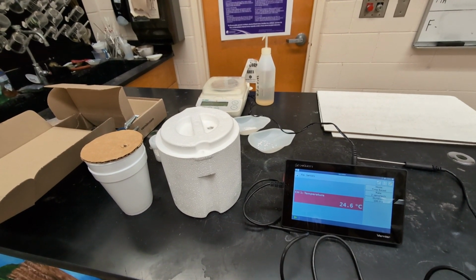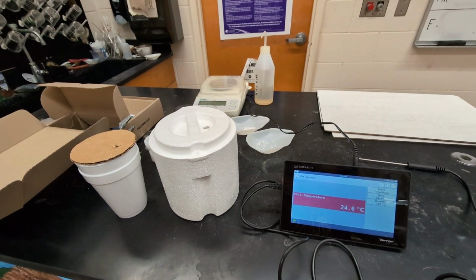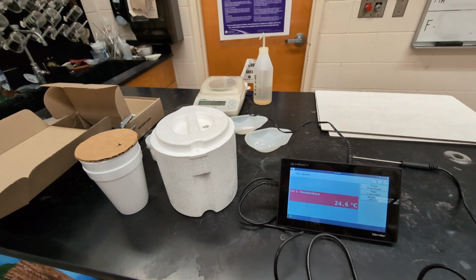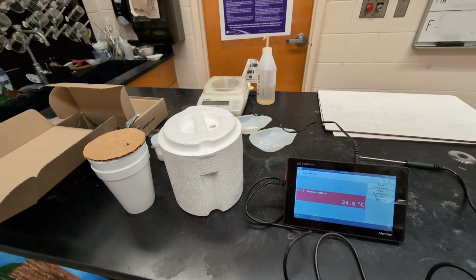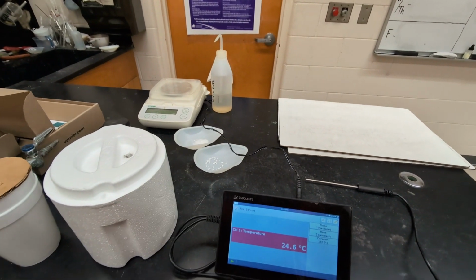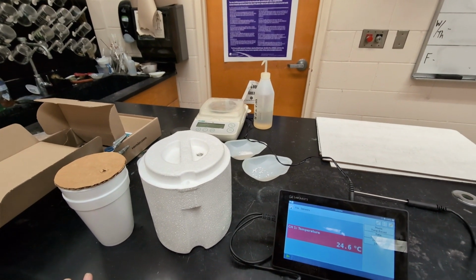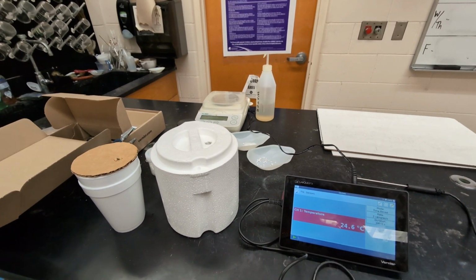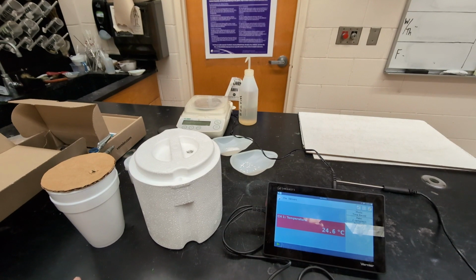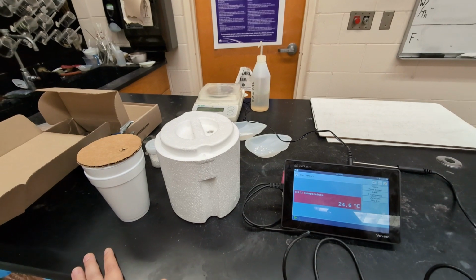But heat of solution is what we're going to do today, and I'm going to use two different substances. Typically, I'll give my students 5 or 6 options, or I'll give one to each group, and then they can decide as a whole class based on the results. But the ones I'm going to show you today are calcium chloride and then sodium acetate. And I have 1 gram of each of those, and then 100 milliliters of water. Another aspect of inquiry here is you could have students design the amounts and the amount of water. So it really just depends on how deep you want to go into this with your students.